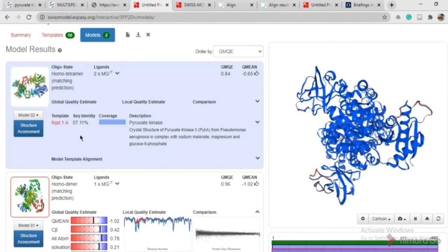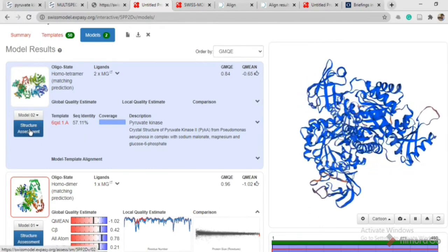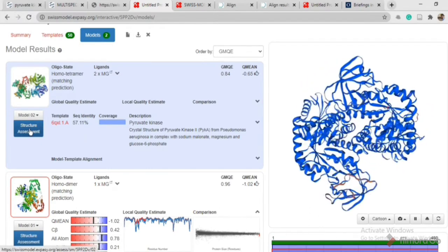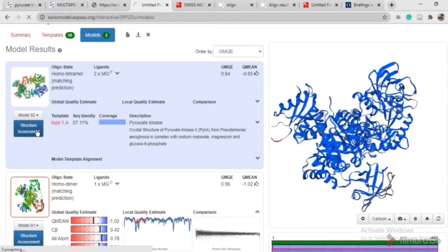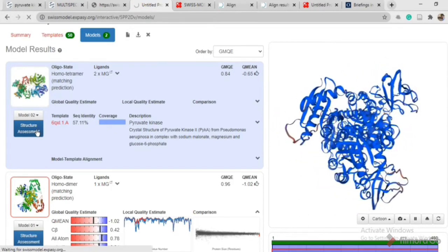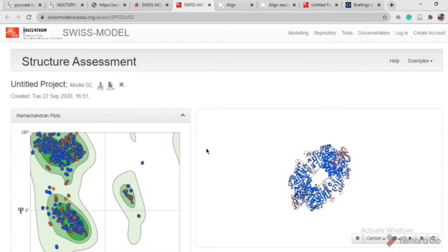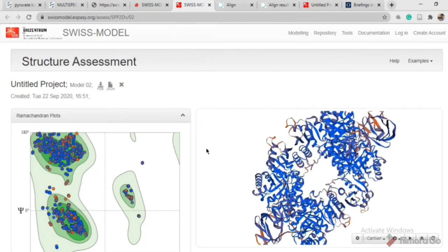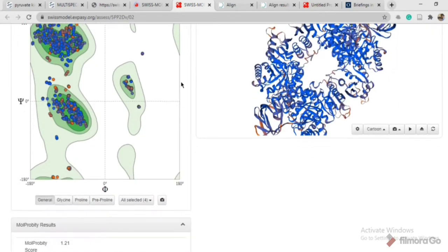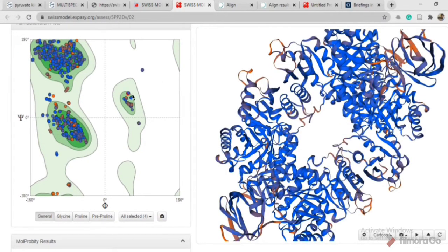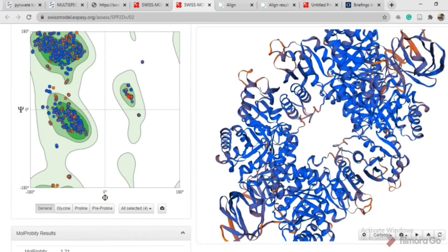If you want to know about the Ramachandran plot, click on 'Structure Assessment.' You can get a Ramachandran plot for either model one or model two. Click on Structure Assessment and in the next step you will get a Ramachandran plot. You can also get information about which residues are involved in forming left-handed alpha helices, right-handed alpha helices, or beta-pleated sheets.